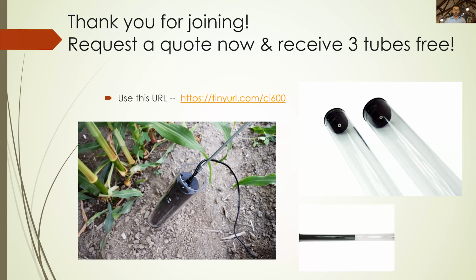Can you see mycorrhizae with the root images? Yes. I believe I had one picture on the slide that was showing some of the mycorrhizae as in root hairs, but yes, you can definitely get down to that level. Now, with those higher scans, I do want to say that it is going to take a little bit longer to do a full scan around, but you're able to see it.